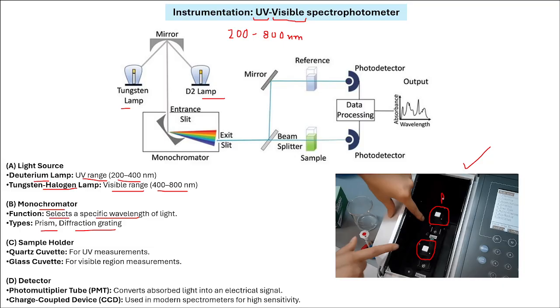Now, this is the reference. At this position, you put the reference cuvette, and this is your experimental sample. Whatever readings, whatever absorption or spectra that you record, will be in reference to this one. Suppose you have your nanoparticles suspended in DI water. So this is your experimental sample.